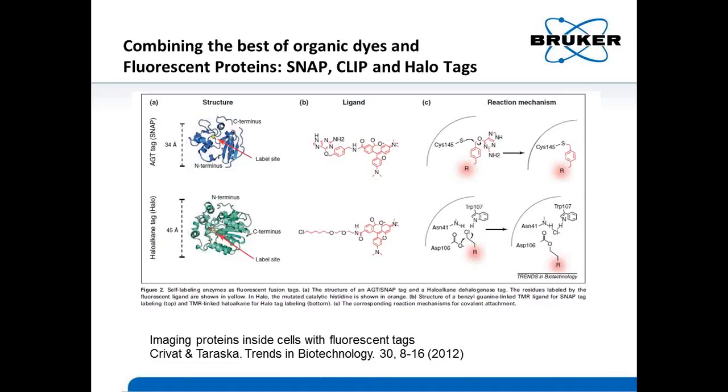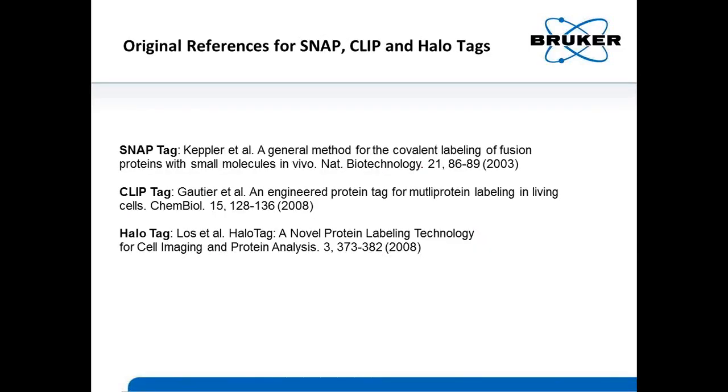So you're essentially doing transfections or electroporation, but at the same time, there's a lot of dyes that are cell permeable, and since you can live label them, you have great flexibility for doing live cell imaging and still be able to get the high number of photons that you'd get for organic dyes. So this is the field that is rapidly evolving now in terms of doing live cell super resolution imaging.